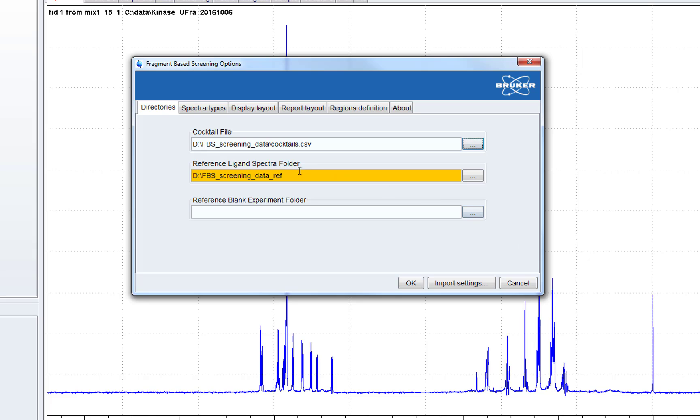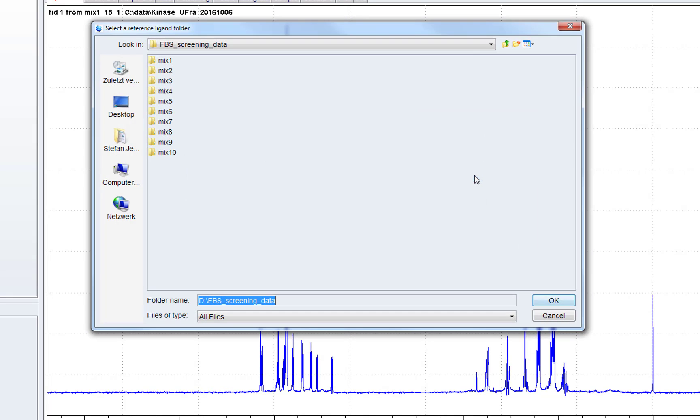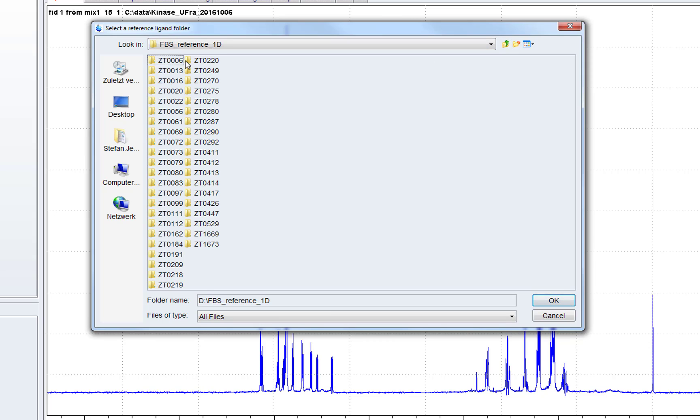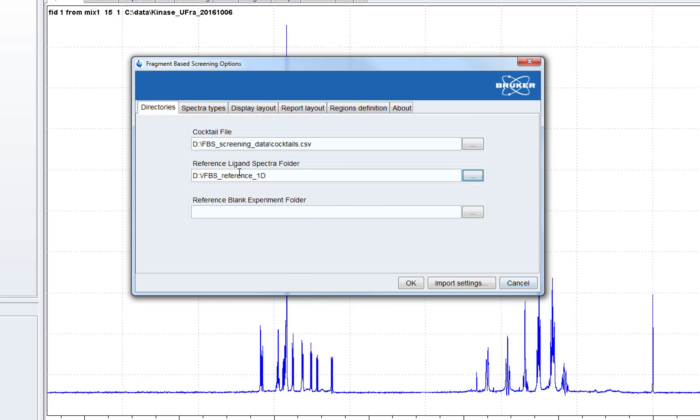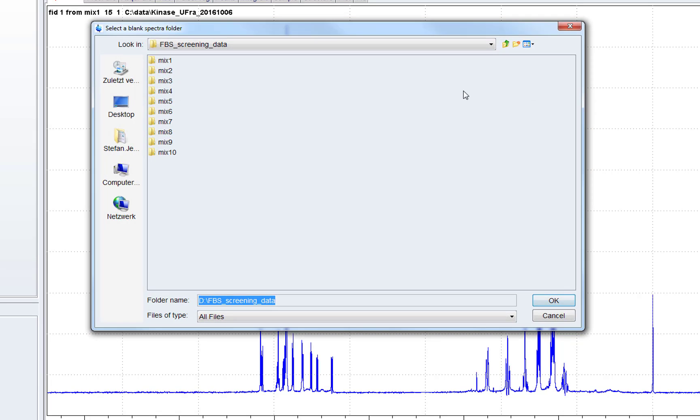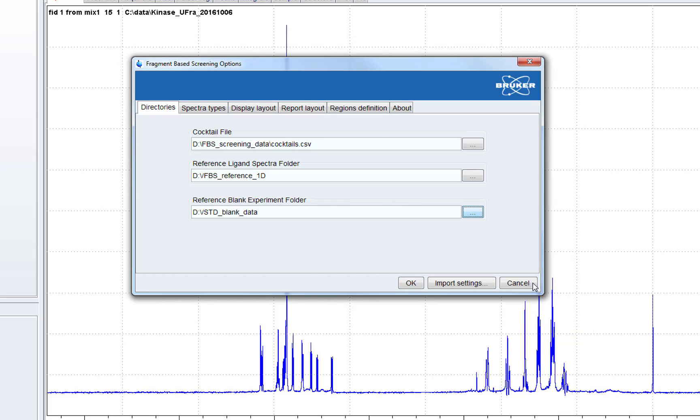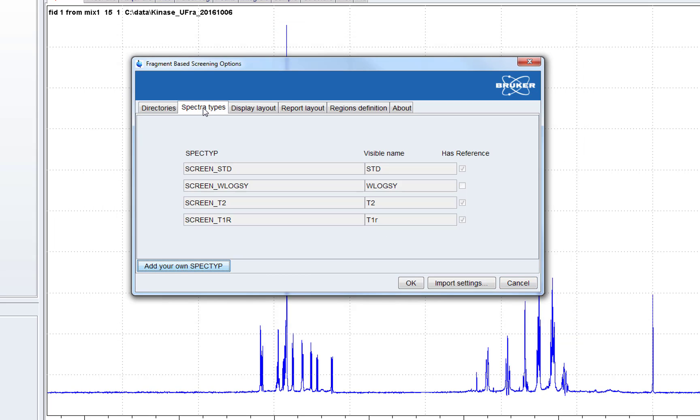We have to choose the folder with the reference 1D spectra of the ligands. And optionally we can choose a folder where blank experiments are located. These are experiments of the mixture but without protein present.